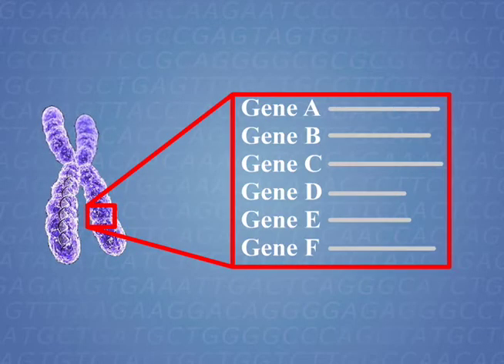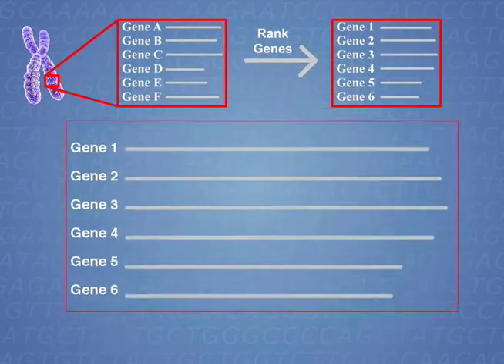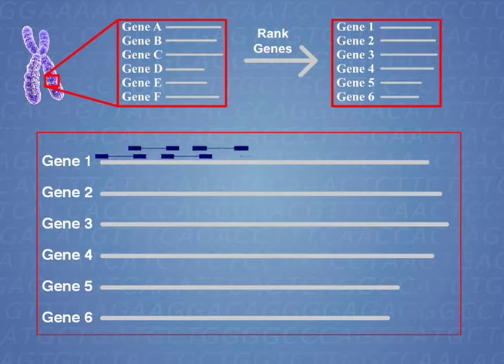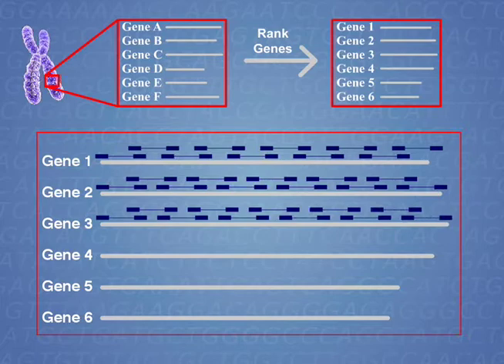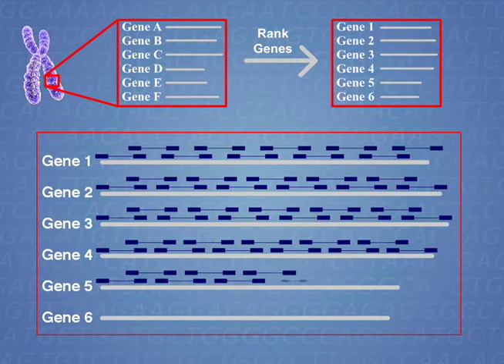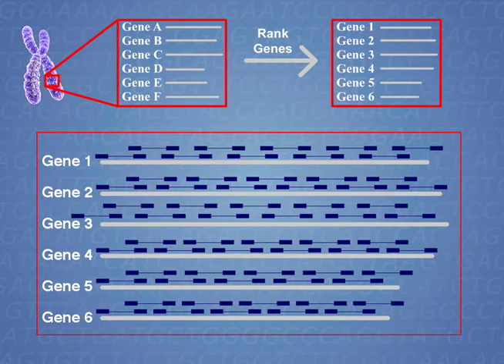From a locus interval or a set of genes, a ranking is given to each gene. Then, progressing from the first gene to the last, experiments are designed to cover the entire gene serially 5' to 3', spanning the complete coding segment of the gene. This process continues until the mutation has been found, or, even more often, until all resources have been used. The time and cost for each experiment quickly adds up with a large tissue set and list of candidate genes.